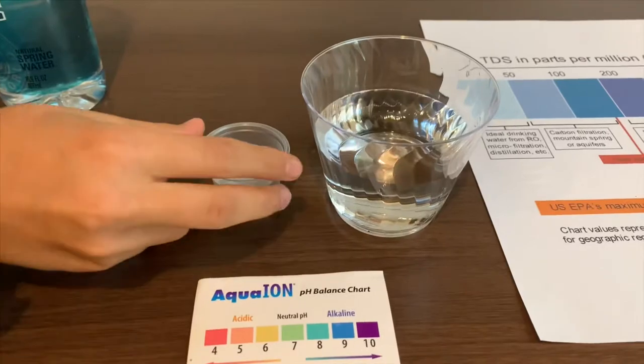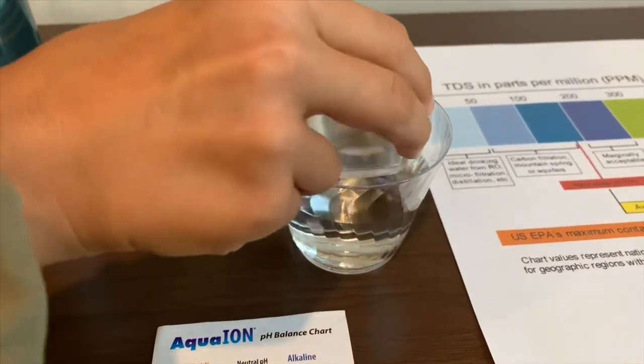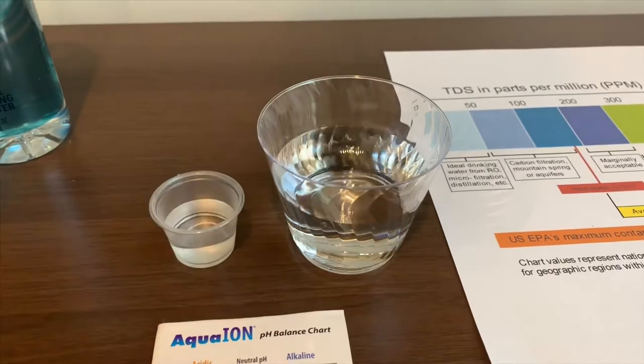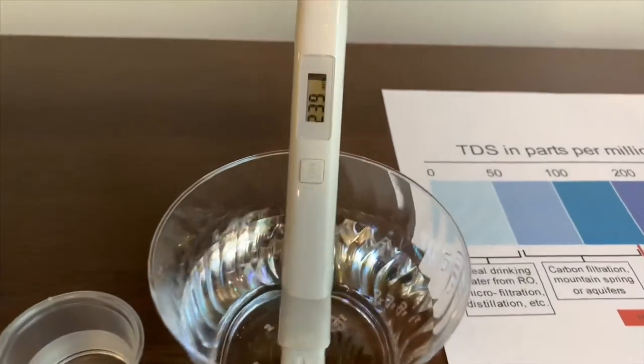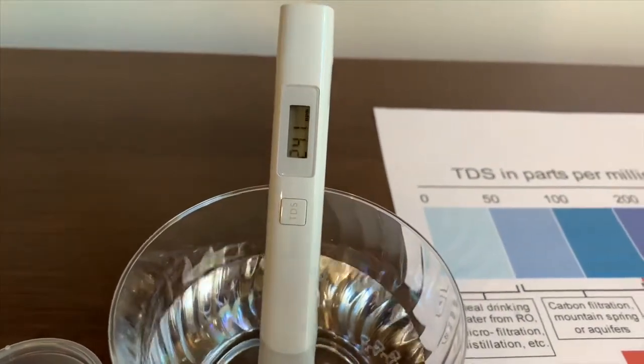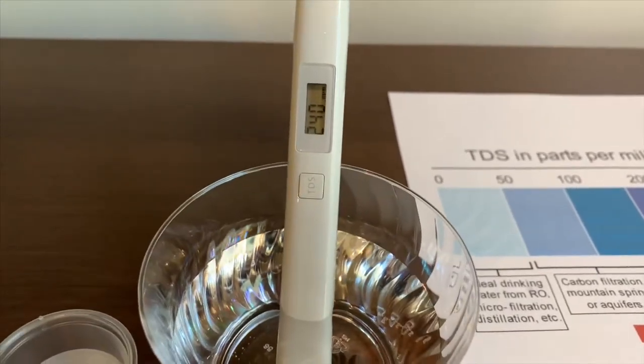That's a little too much for the pH cup. Let's pour some inside the TDS. Let's turn on the TDS tester and make sure it says 0. Put it in and let's wait. 239 — that's average tap water.